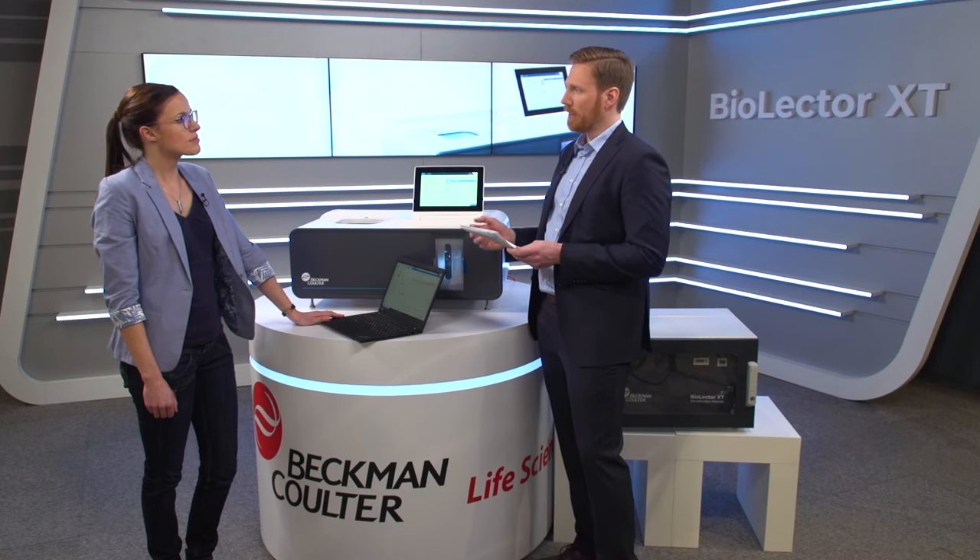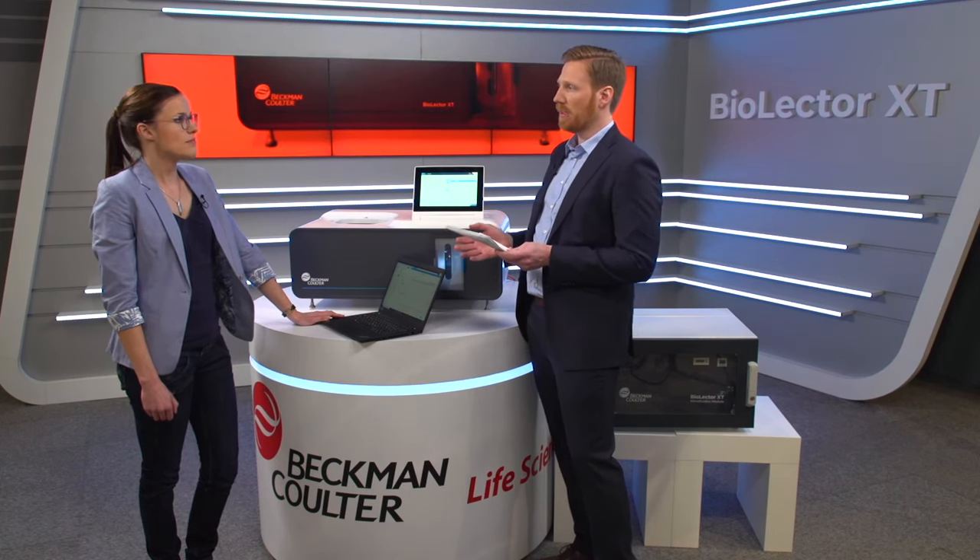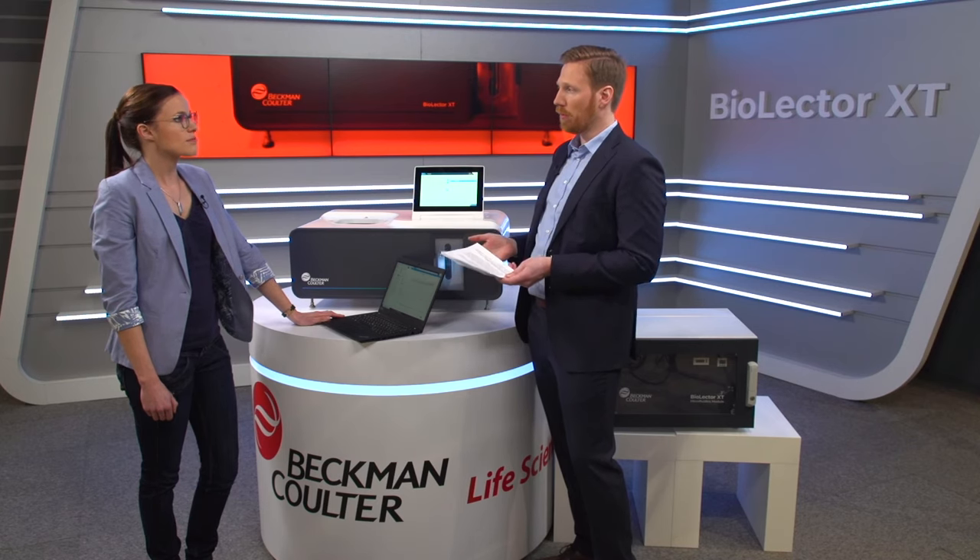And that's the reason why the BioLector XT enables real-time evaluation of biomass, fluorescence and other key cultivation parameters for aerobes and anaerobes? Yes. This quickly provides deep insights into your bioprocess. For this reason, some of our customers even call the BioLector a publication machine. You can read lots of publications about scientific research based on the BioLector.